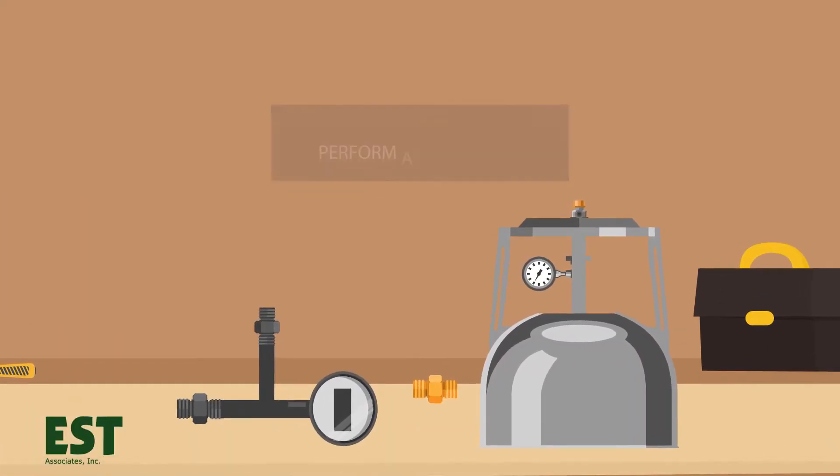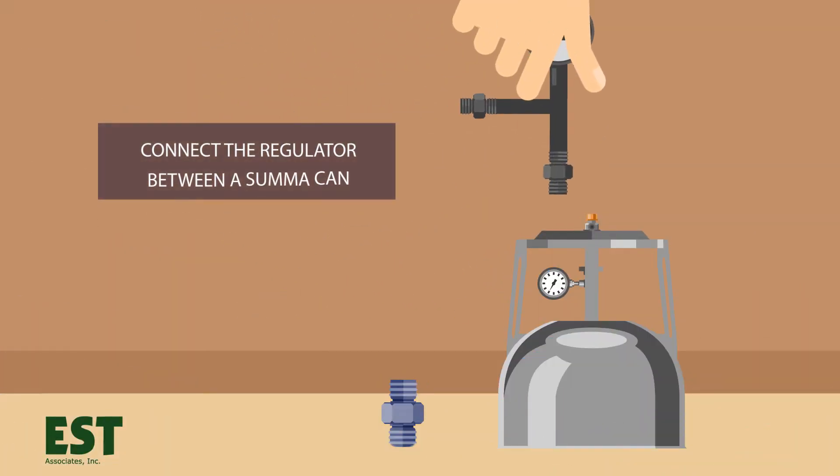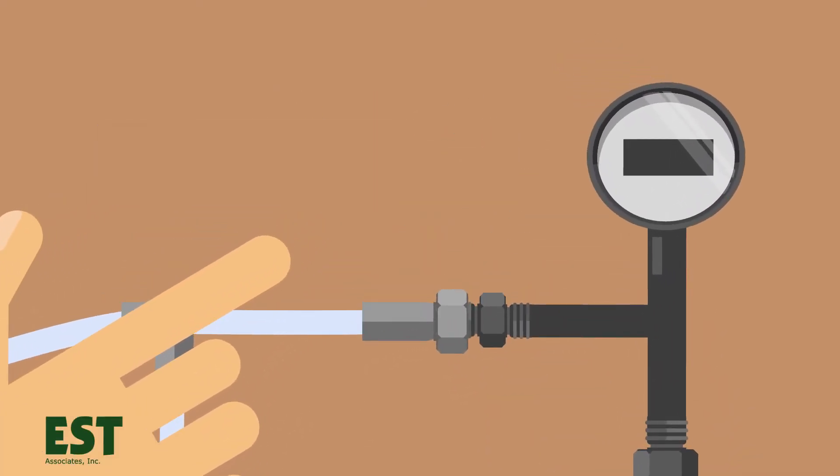Next, perform a shut-in test before sample collection. This will ensure that all fittings are tight and that there are no leaks between the can, regulator, or sample container. Connect the regulator between a SUMA can, then connect the sample train to the sample port and perform the shut-in test.